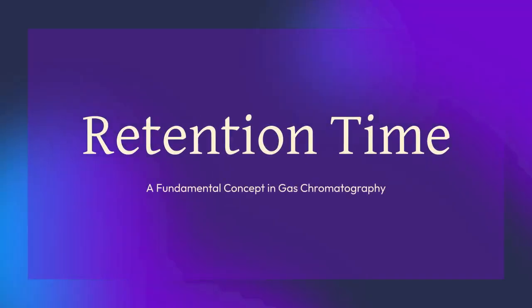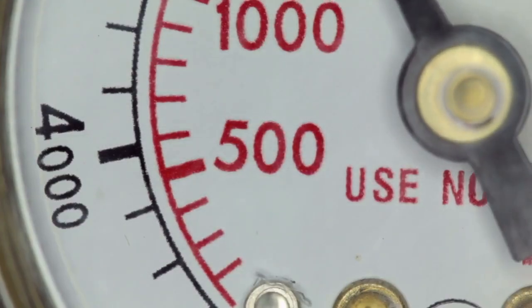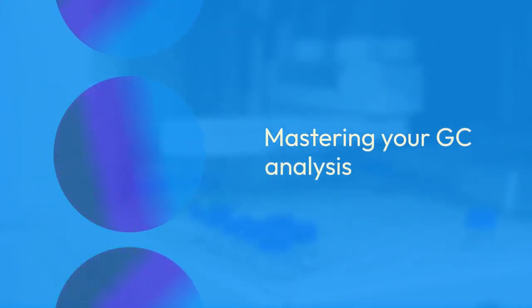Hello everyone, and welcome. Today, we are diving into a fundamental concept in gas chromatography, retention time. We'll break down how to calculate it and what those calculations really mean for your results. Understanding these numbers is key to mastering your GC analysis, so let's get started.